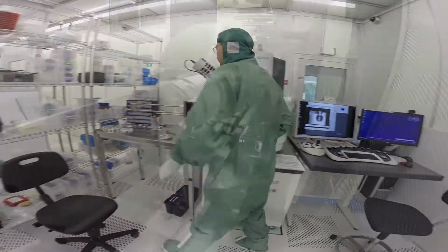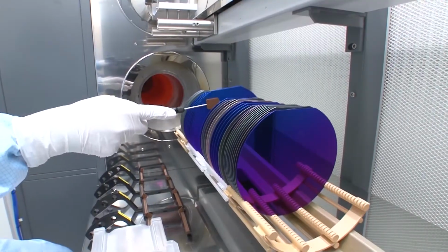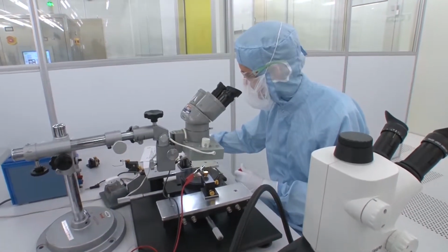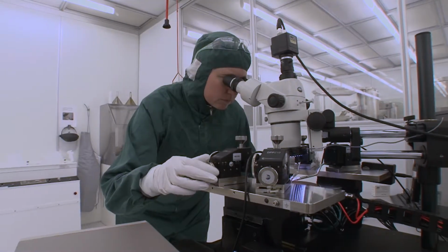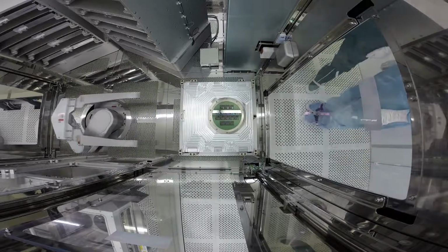Our equipment and products are highly sensitive to external influences, particularly contamination with foreign particles. As both the equipment and products are very expensive, it costs a lot of money if we have to stop production because of alarms or contamination. For this reason, it's very important that you comply with a number of measures when you're going to work in our clean room. In a clean room, the number of particles has to be kept below a certain level.